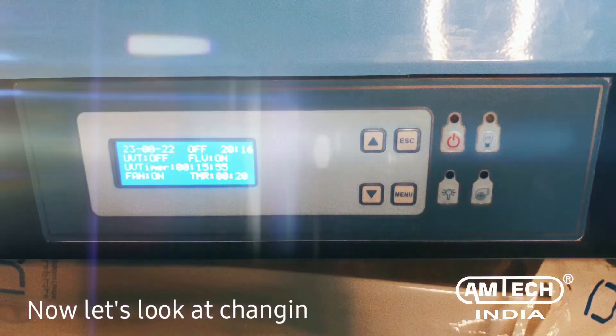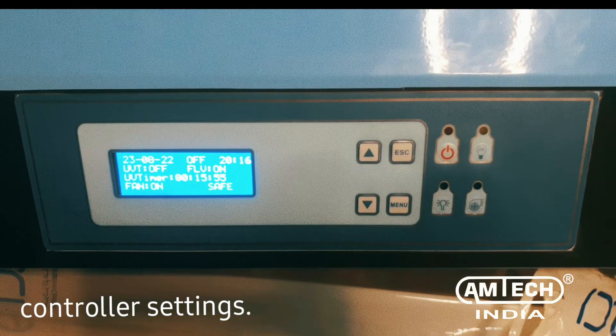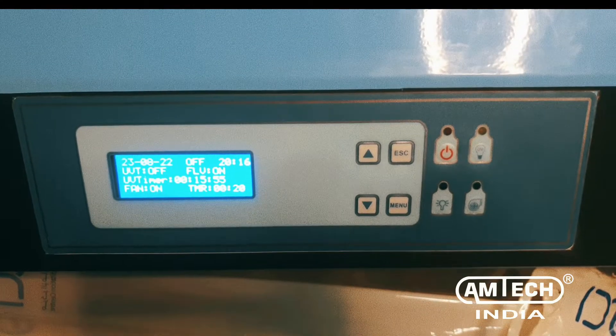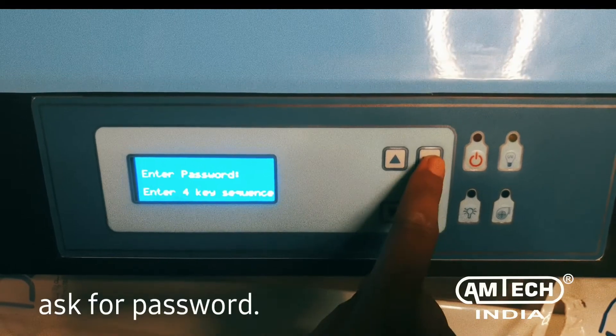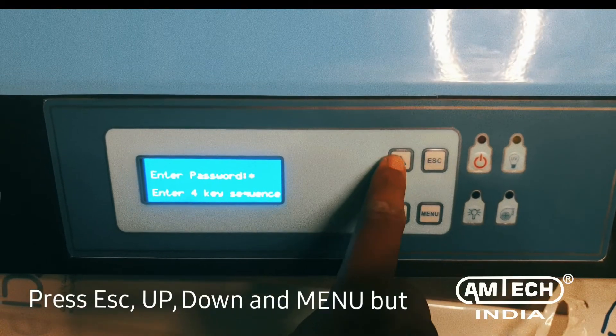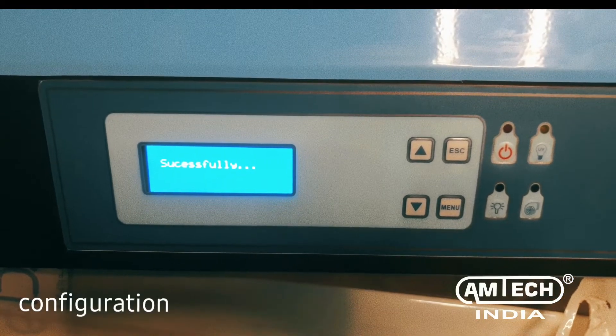Now let's look at changing the digital controller settings. Press the ESC button; the system will ask for a password. Press ESC, up, down, and menu button as the password. Now you have unlocked the system configuration.